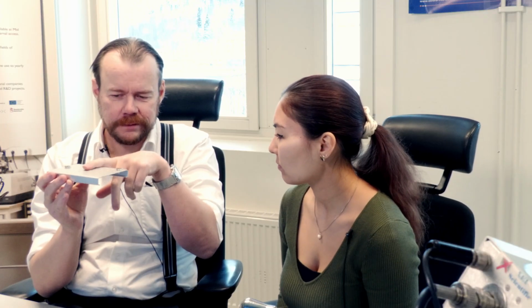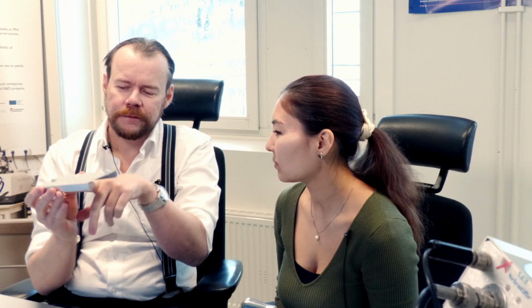So when you tilted it, we saw that it moved. Why does it move? The reason why it's moving is, let's say that this is our sample stage, and then our area we're viewing is over here. And when we're tilting, the rotating axis of the machine is of course fixed. You cannot move the axis of rotation. So if the sample is over here and you're tilting, you see it will translate in this direction. So that's why it moves.